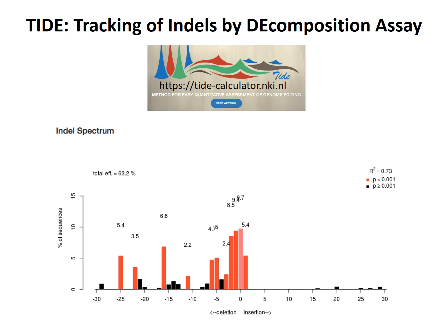Yeah, I've been able to even find a 34. At one point I was doing a project where I was inserting a loxP site, a 34 base pair loxP site, and I was able to use TIDE to show that in the population there were clones that incorporated that 34 base pair loxP site by expanding the amplicon size window as well.